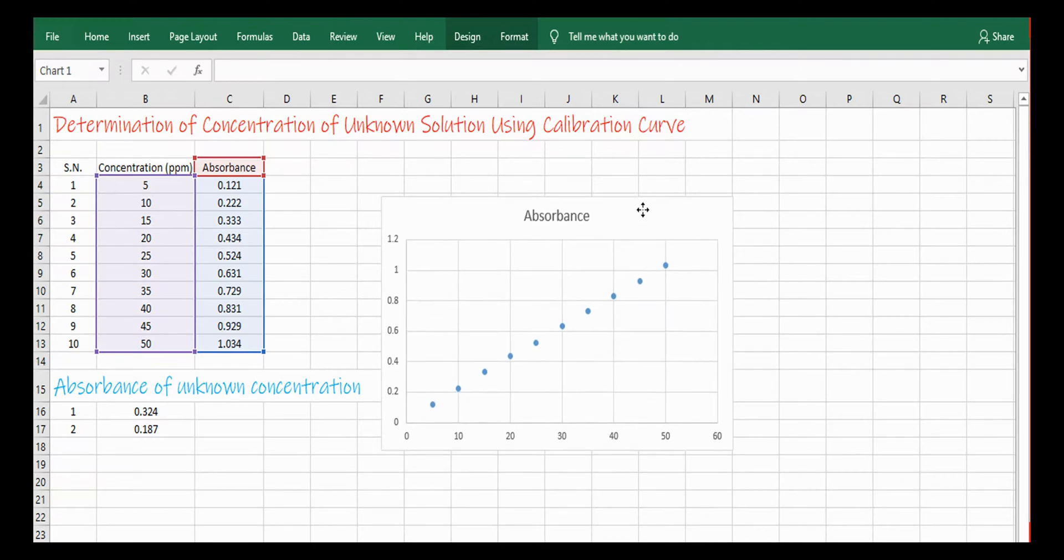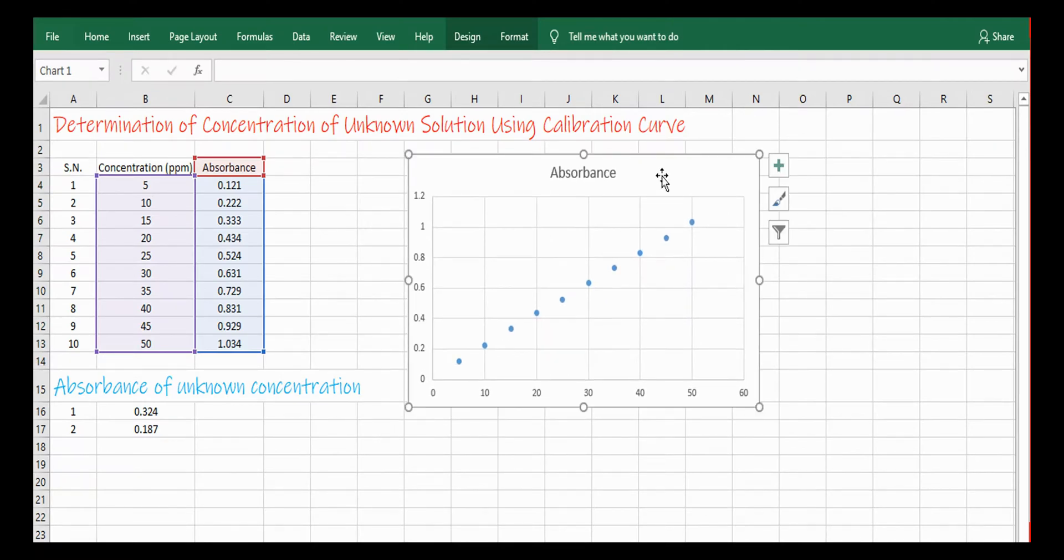Then you will obtain this type of graph. You can drag it to move anywhere you like to shift the graph. You can also put the name of the chart. To put the name of chart, simply you can click on it and can write the name.